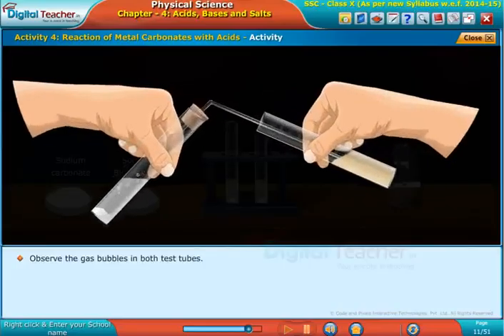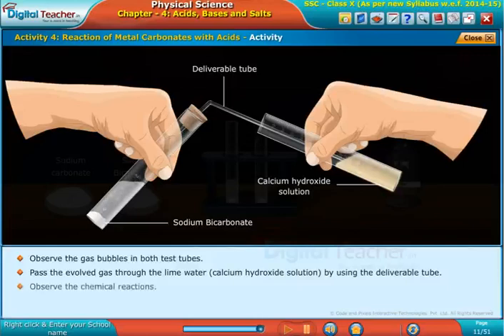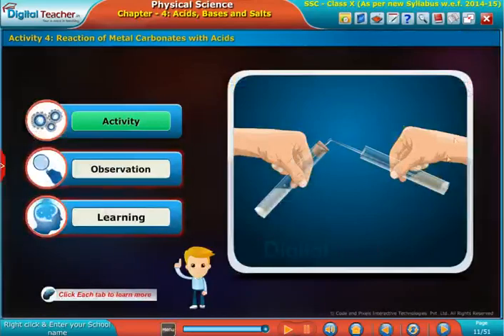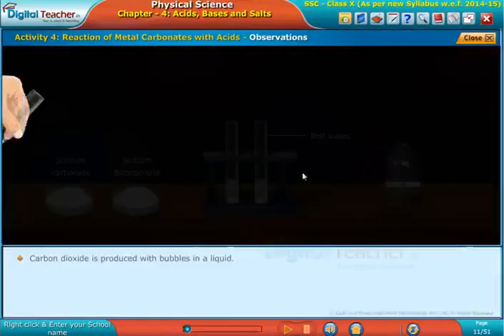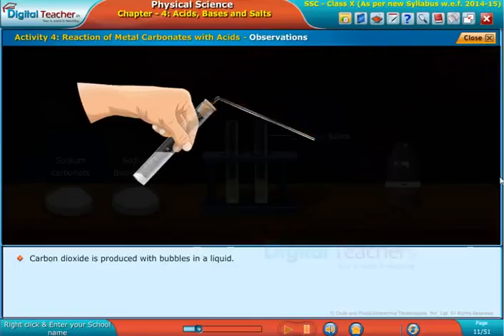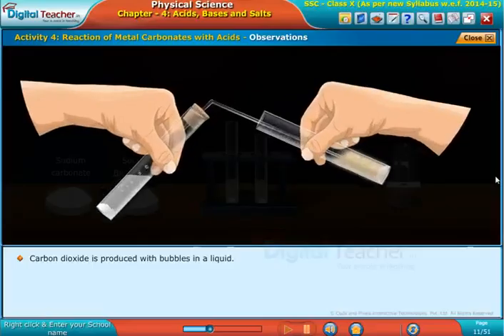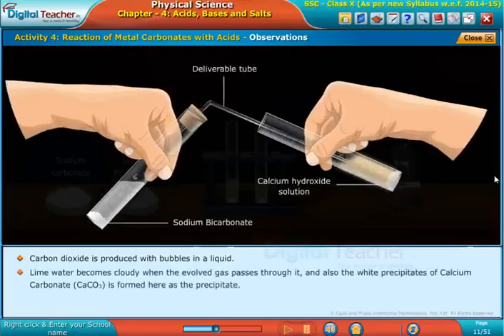Observe the gas bubbles in both test tubes. Pass the evolved gas through lime water (calcium hydroxide solution) by using the delivery tube. Carbon dioxide is produced with bubbles in the liquid.